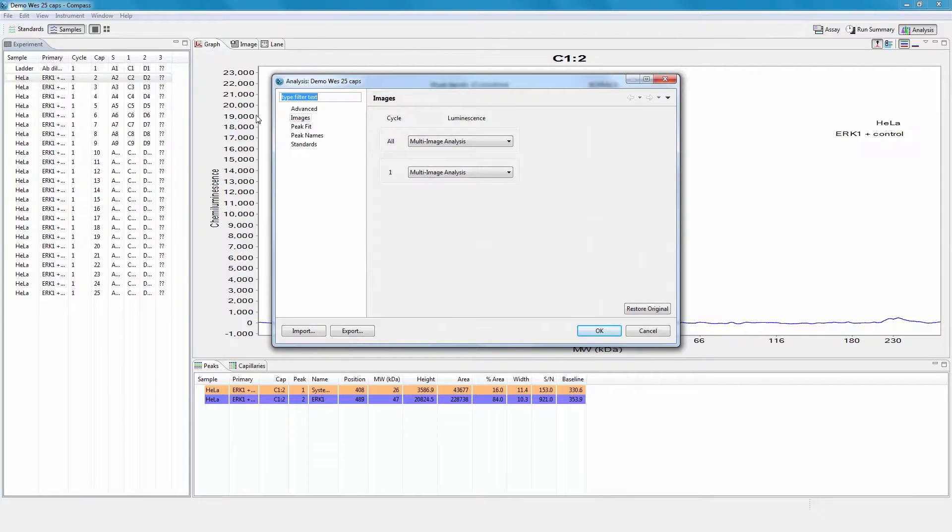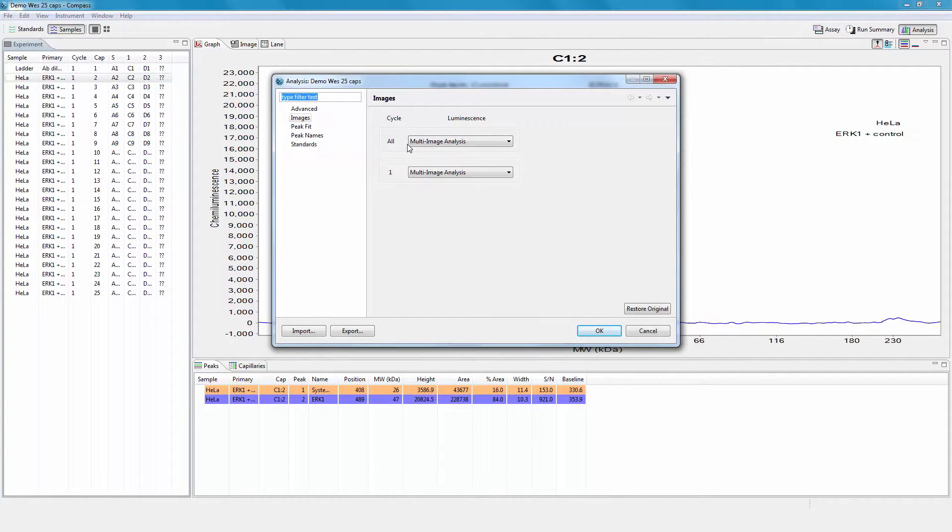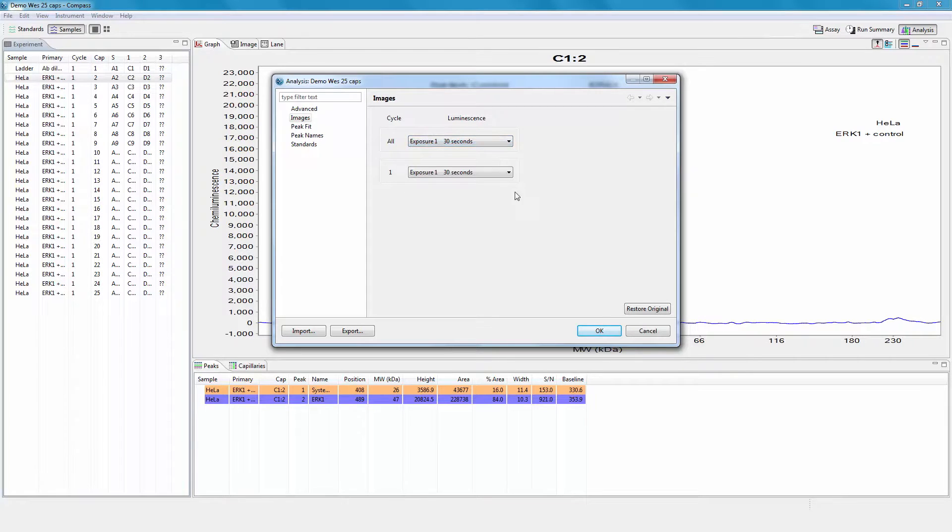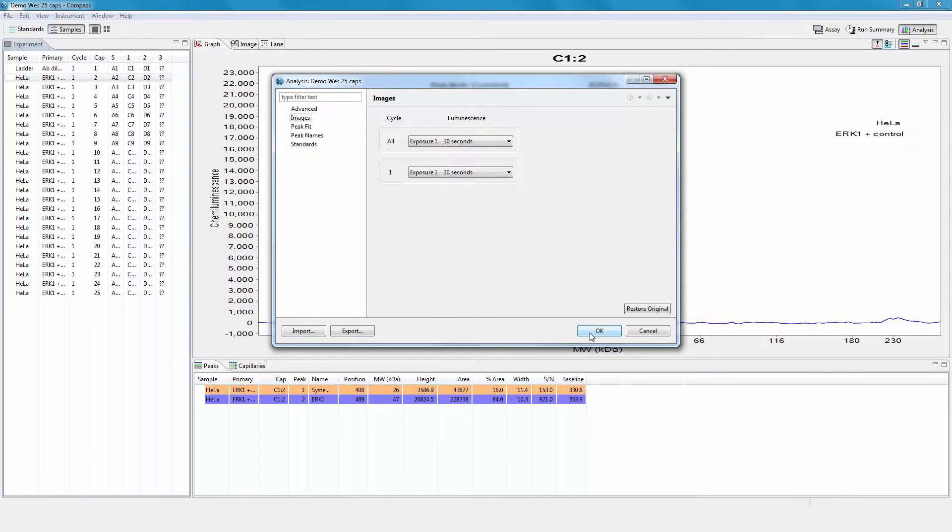Then click Images in the options list. All exposures that were defined during assay setup are stored in the run file, and each can be viewed individually by selecting it from the drop-down list. Select each exposure time and look at the chemiluminescence data to determine the best exposure for analysis.